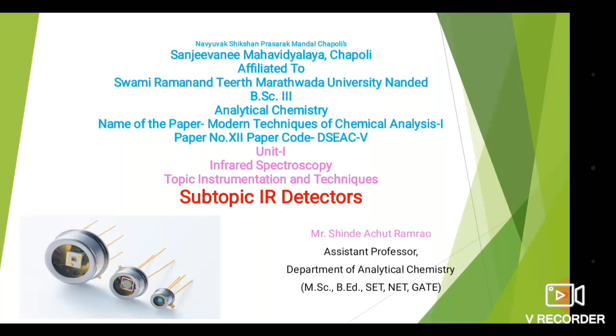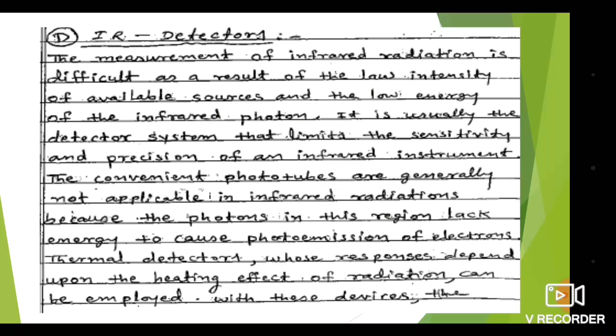In yesterday's lecture, we learned about the different types of sampling of substances and sample cells. In today's lecture, we are going to learn about the IR detectors. So, let's start with these IR detectors.